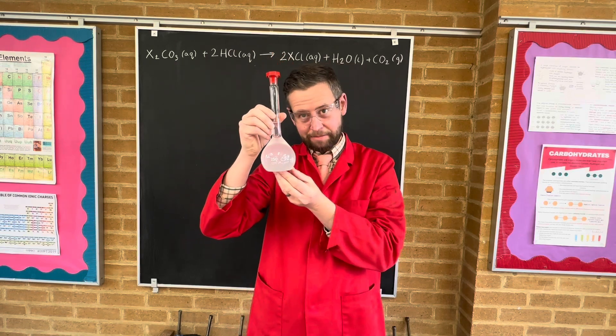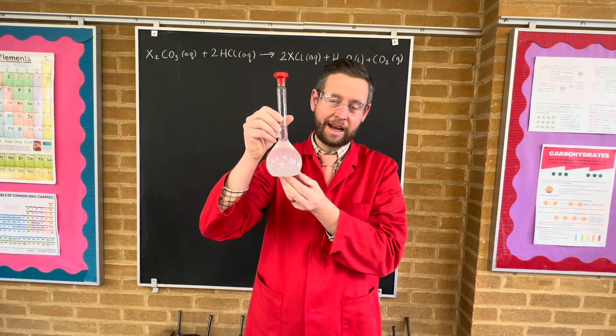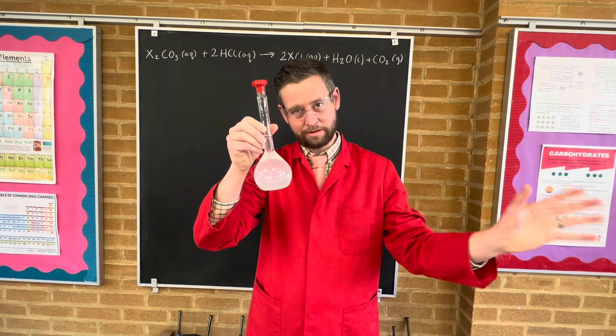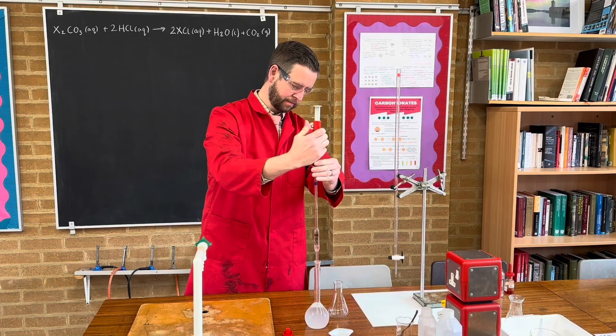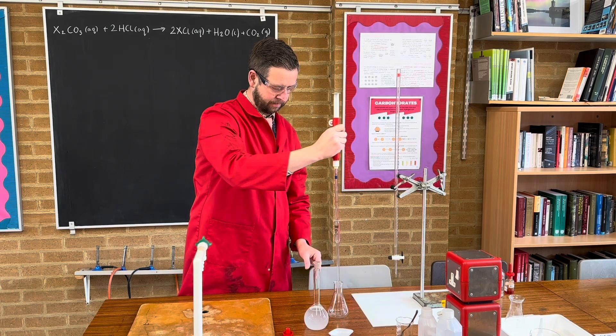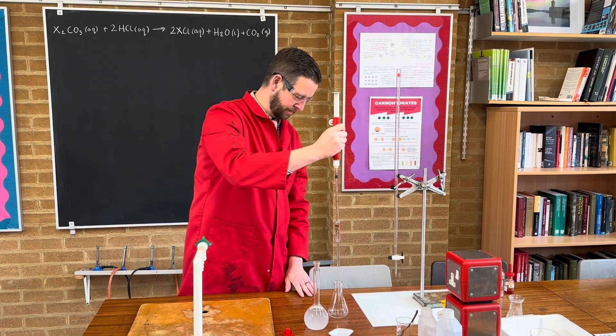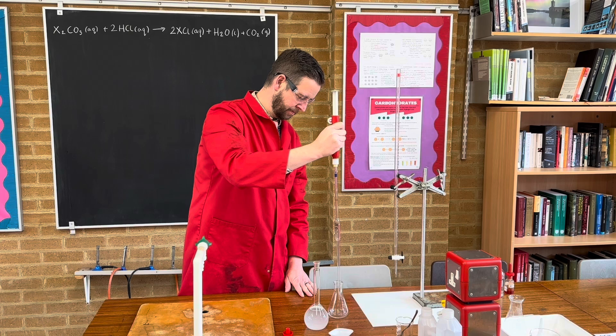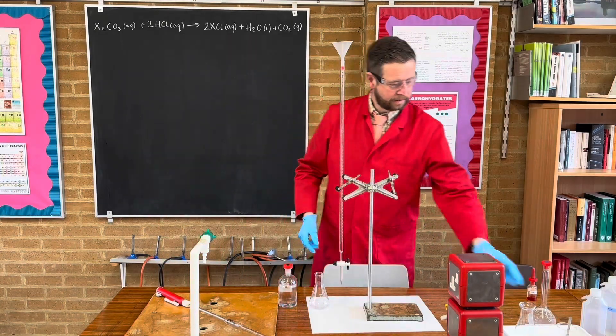We're going to take 25 milliliters of this and now add it to a conical flask to go underneath.